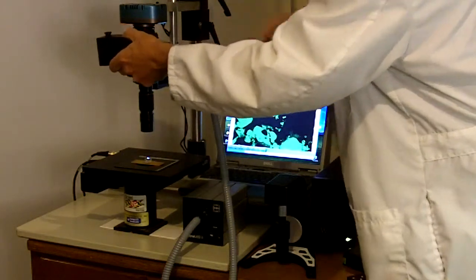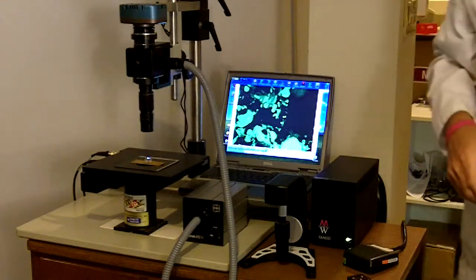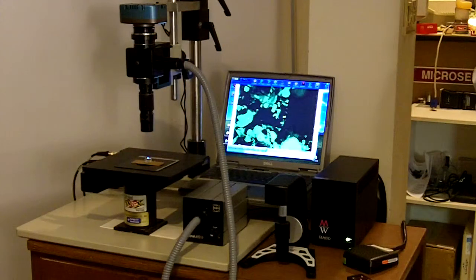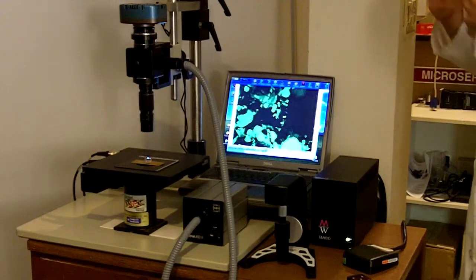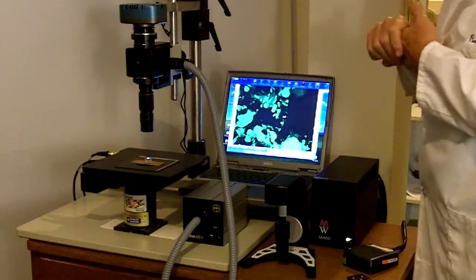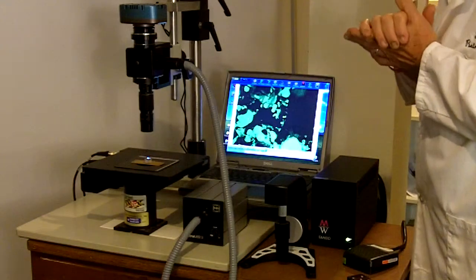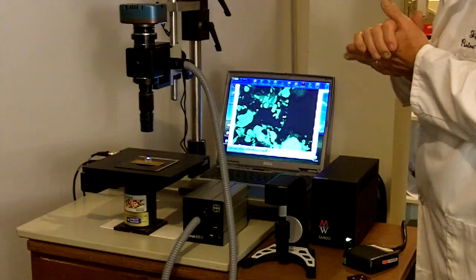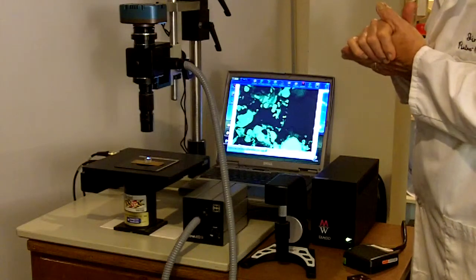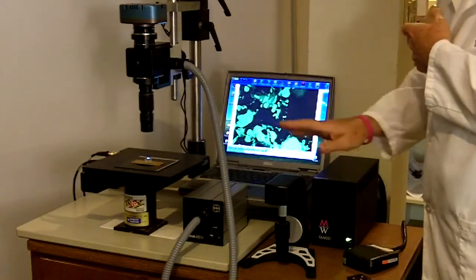The cameras are then configured at right angles to one another and you have a very nice system that's available for future expansion. But this as you see it is the basic retro floor with a single camera attachment. And to enhance the system at this point in time we are showing it with a Mertzhauser stepper motor stage.